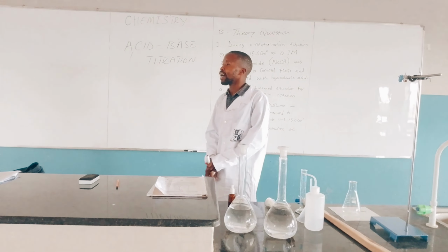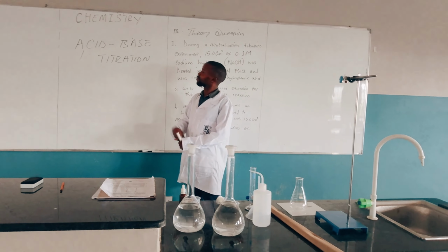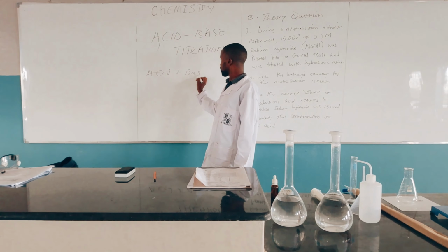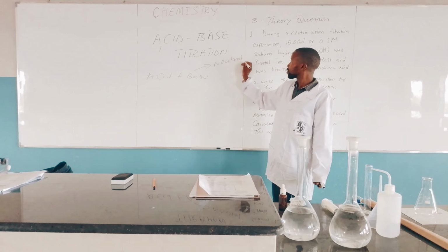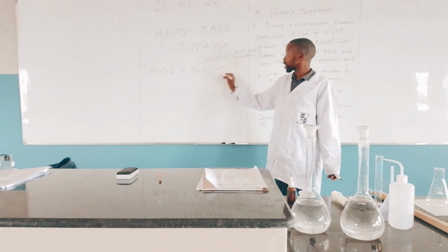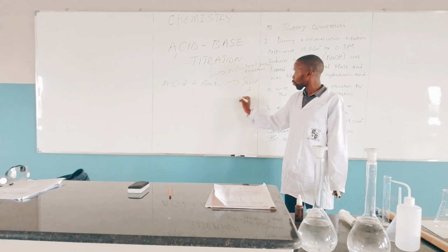Our focus is on acid-base titration. We're going to talk about a reaction between an acid and a base. We call it a neutralization reaction, which means salt and water.